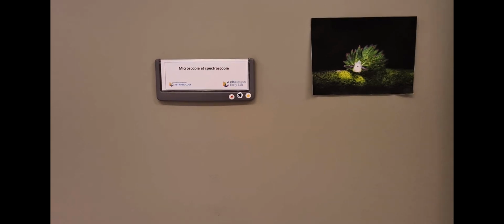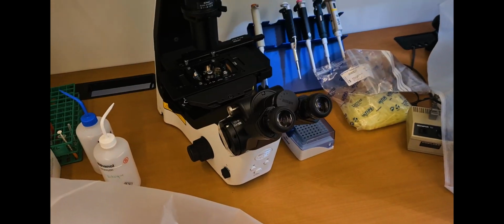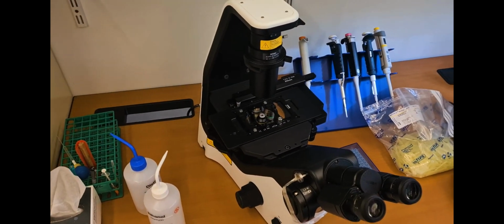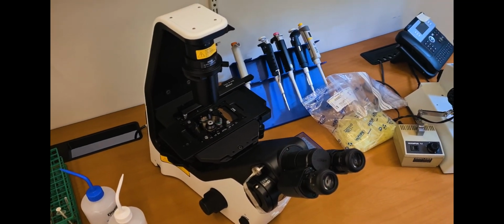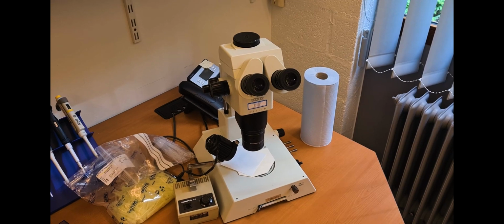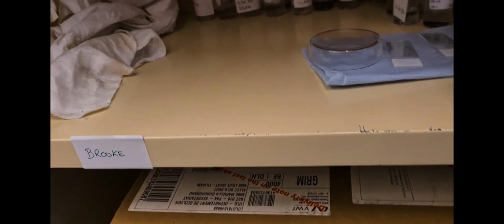First room we're going to look at is the microscope room, which has this cute little nudibranch on the door. This microscope is for looking at the fossils once we've extracted them from the rock and the macerations, and this one here is the upside down microscope we use for extracting them from the dissolved liquid. I'll show you that in a second. This is for placing them on chips and slides so we can analyse them and look at them on different microscopes and analytical equipment.